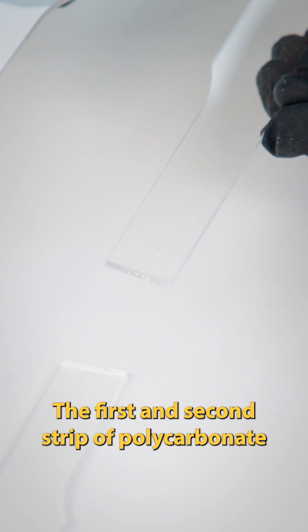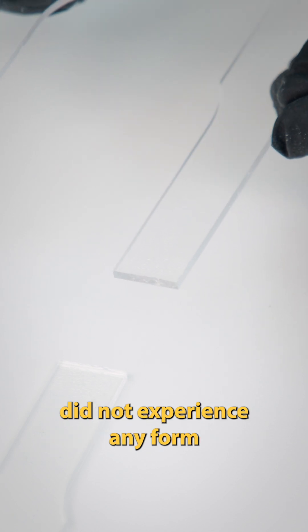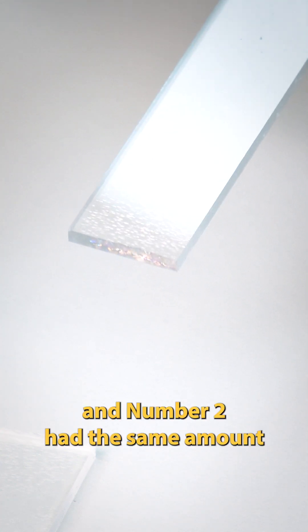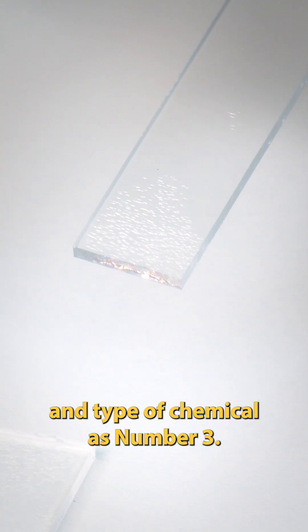However, the first and second strip of polycarbonate did not experience any form of stress cracking, even though number one was under the same amount of stress and number two had the same amount and type of chemical as number three.